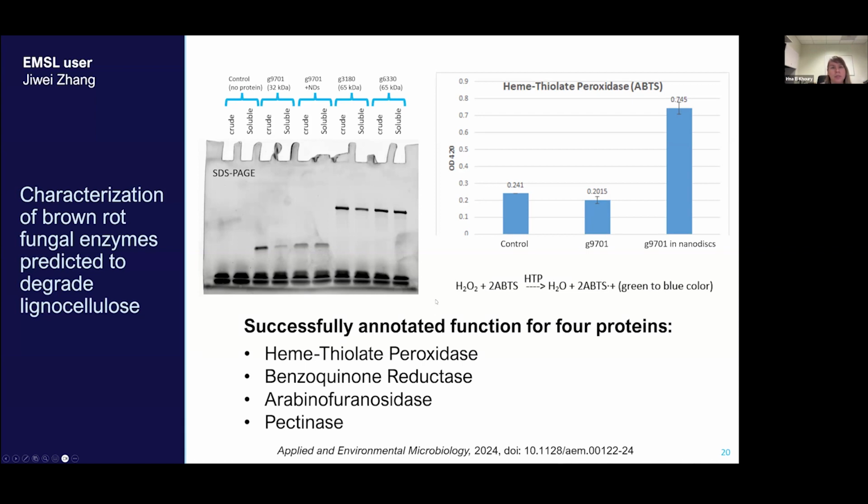Because of that, we really need to make sure that we can provide those PTMs. So we are considering creating and adapting fungal cell-free lysates in the future into our cell-free pipeline to make sure that we create a really ideal protein folding environment. And eventually we want to do in vitro metabolic profiling as well.